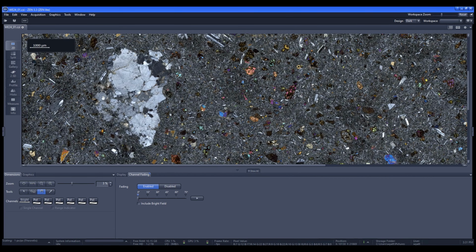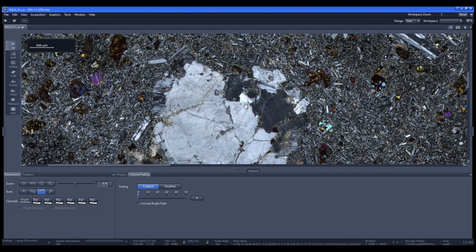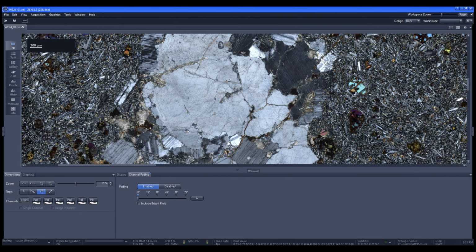Now you might have seen this massive thing here. This isn't one big crystal. This is multiple plagioclase fused together. And typically you'd have other minerals as well, besides just feldspar. But when it's a whole bunch of phenocrysts all glued together like this, it's called a glomerocryst.